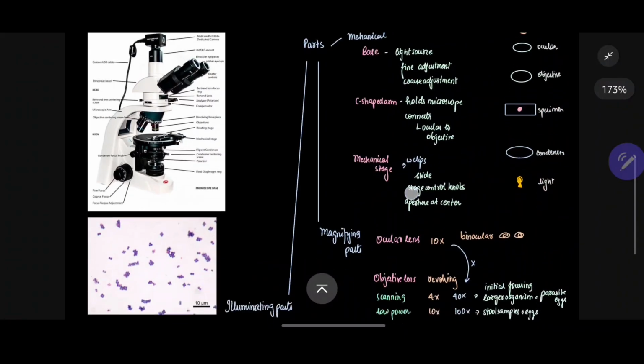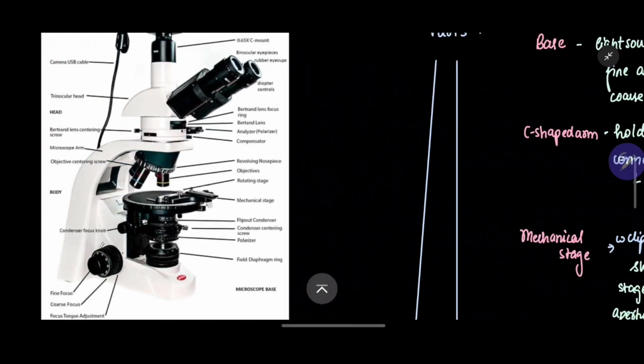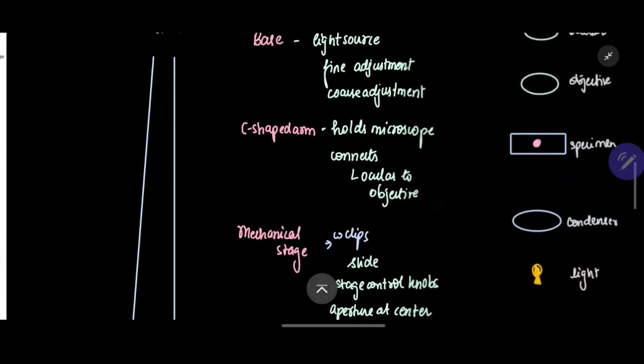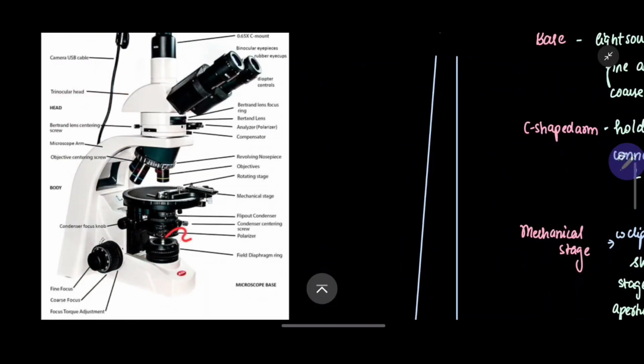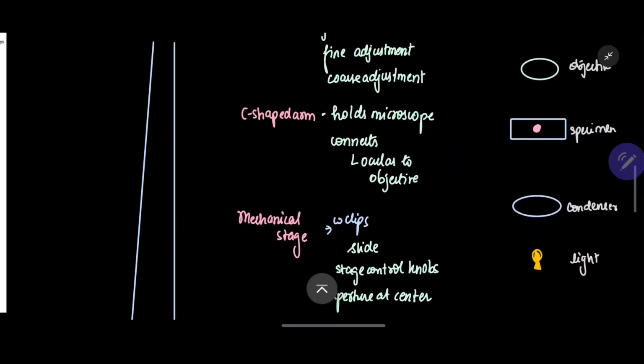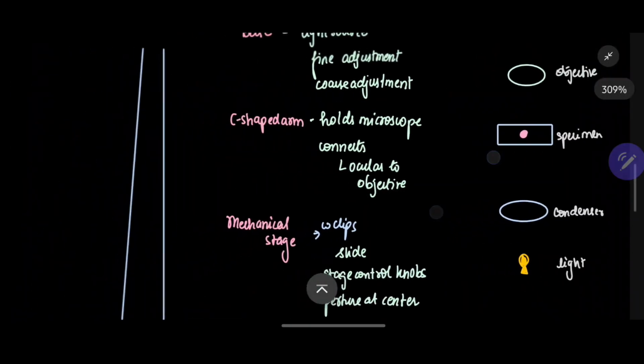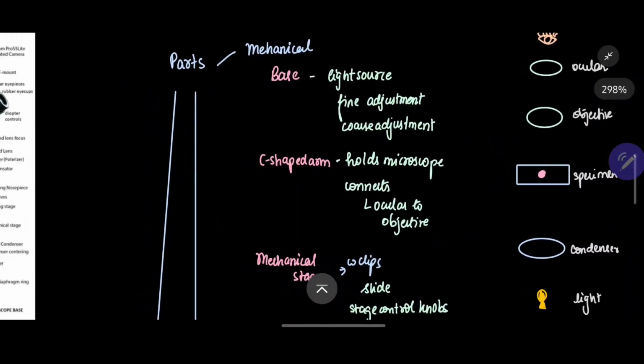Okay. Moving on, let us look at how this works. What's the principle? We begin down here. First there's this light source that we have, which could be a mirror or an electric bulb, right? Your light source is going to send your light. Let us draw the light. We'll zoom this out.